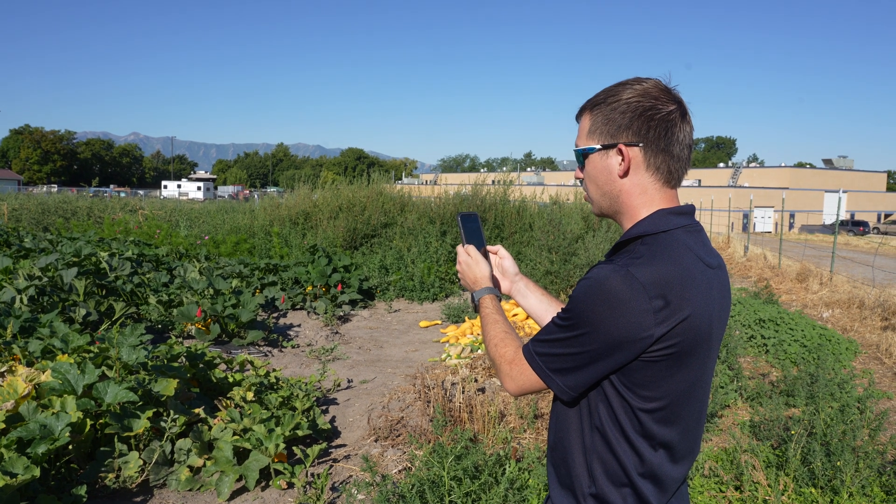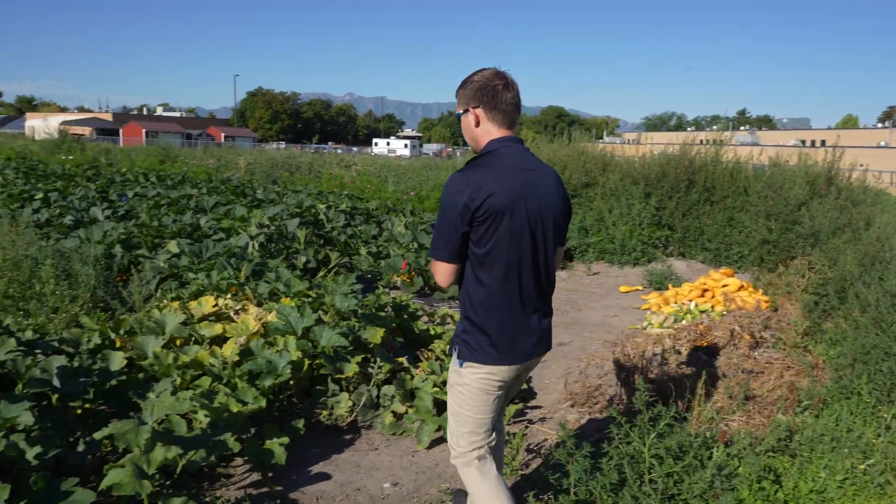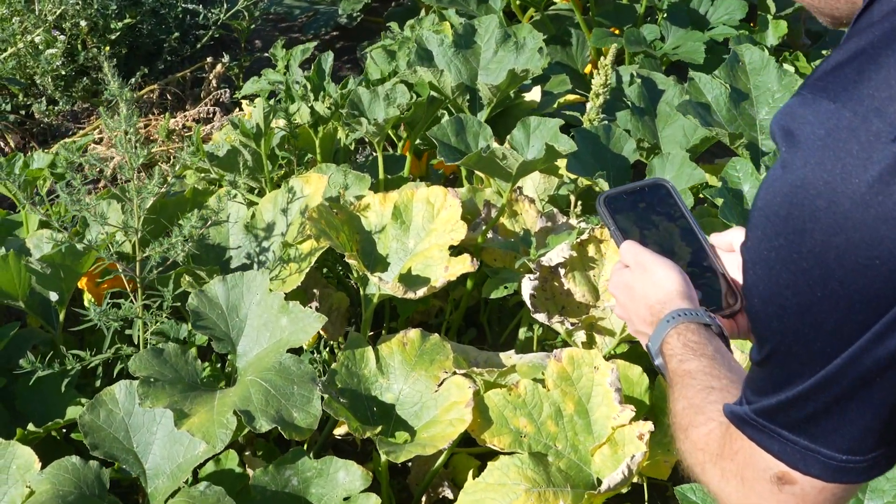If you want to have an unhealthy-looking plant diagnosed, first take a photo of the plant being submitted. Include a wide range of photos from close-ups to zoomed out to provide different perspectives of the plant in question.